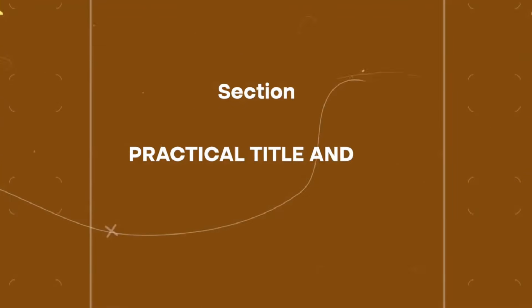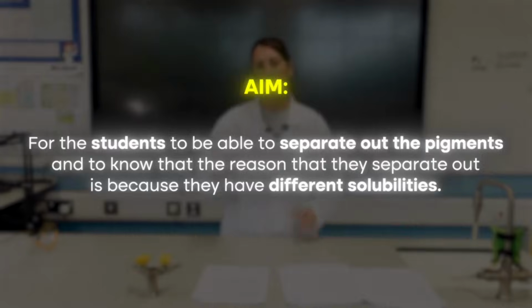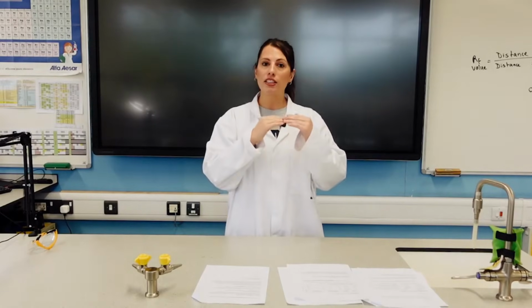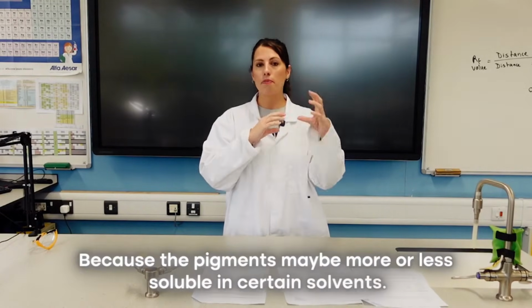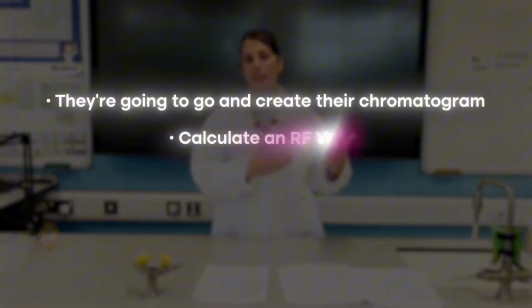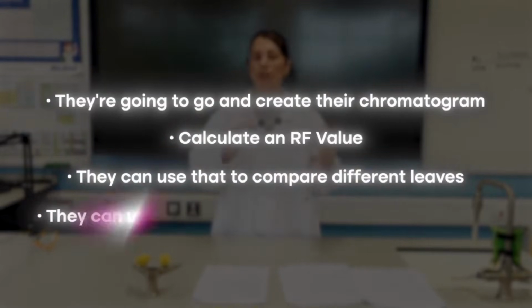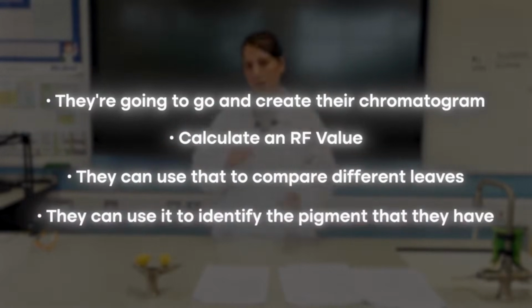So the aim of this experiment is for the students to be able to separate out the pigments and to know that the reason that they separate out is because they have different solubilities. And depending on the solvent that you have, you'll get a different number of pigments because the pigments may be more or less soluble in certain solvents. So they're going to then create their chromatogram, calculate an RF value, and then they can use that to compare different leaves, or they can use it to identify the pigment that they have.